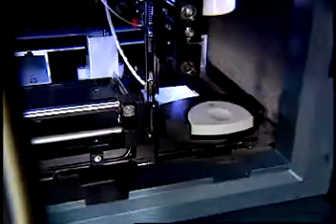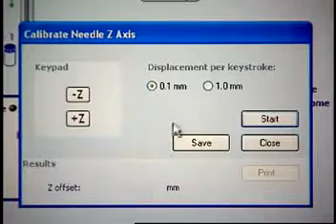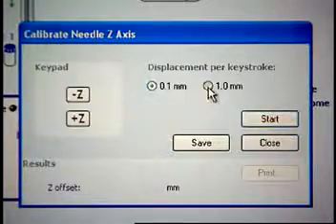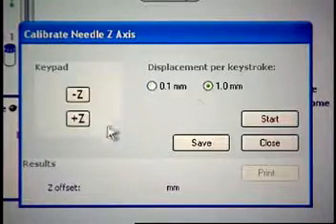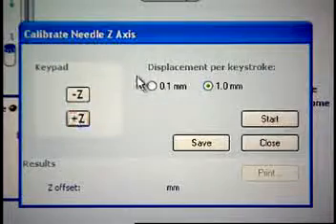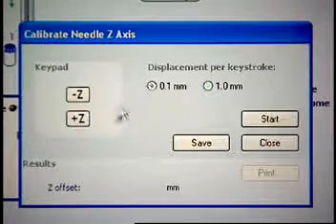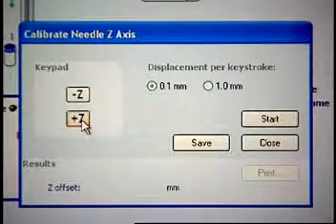Select the 1.0 mm displacement increment, then use the plus Z button to drive the sample needle down to within 1 mm of the card's surface. Switch the displacement increment to 0.1 mm and lower the sample needle until it touches the surface of the card lightly but does not restrict the card's free movement.